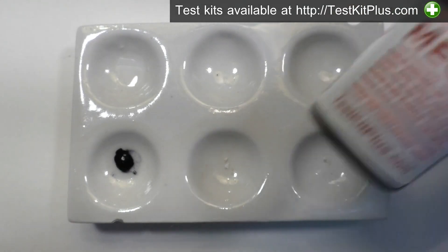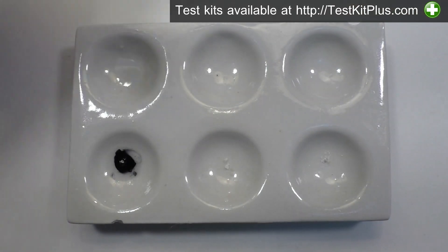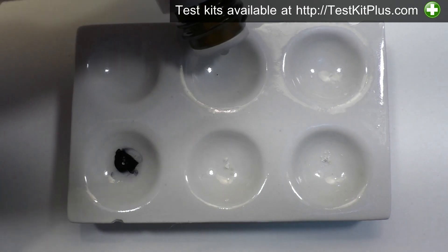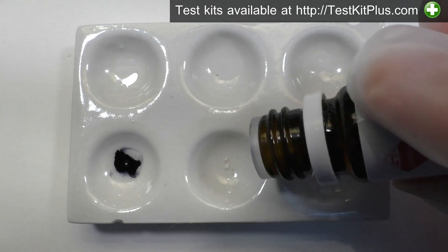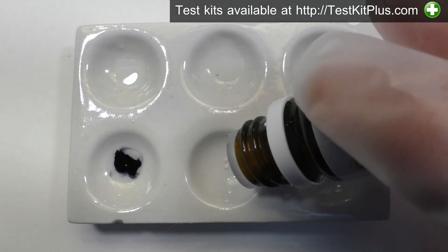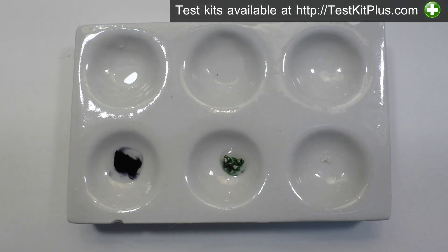Next is the Mecke Test, which will react a bit differently from the Marquis Test. Again I'll put a drop on the side. It starts off as green and goes to black with MDMA. The green color at the beginning is important — if you don't see it, your sample is something other than MDMA.